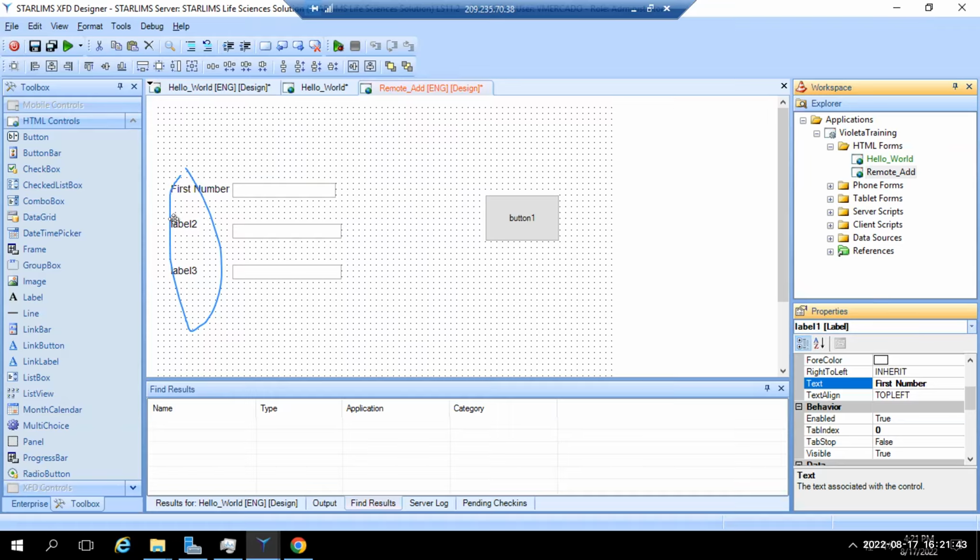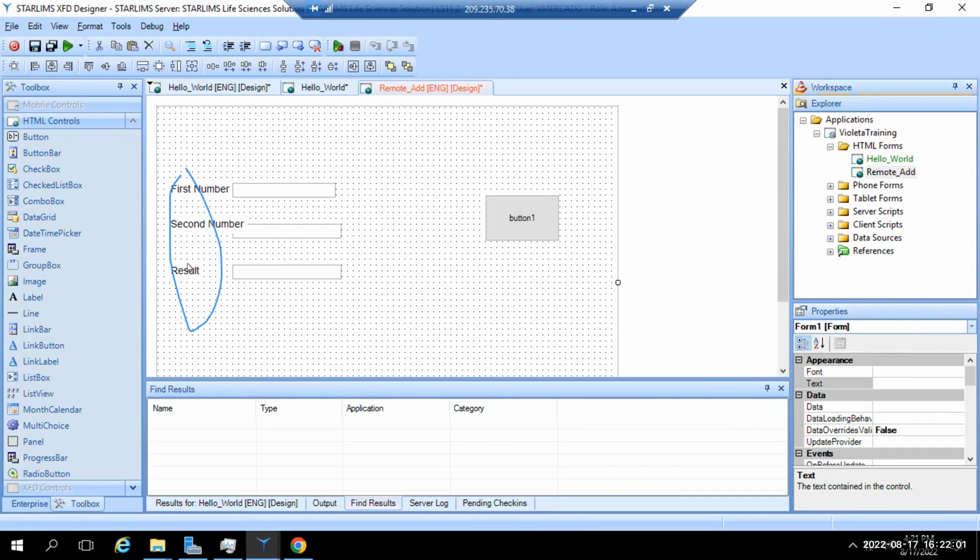And second number. And then result. And then call this guy add.